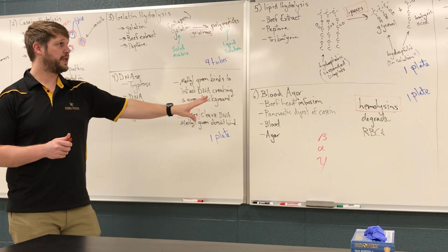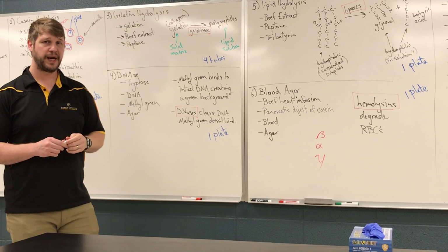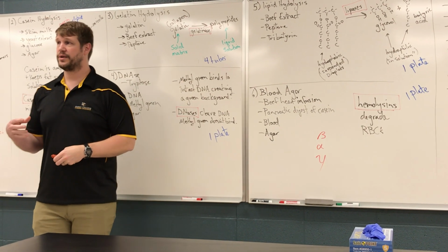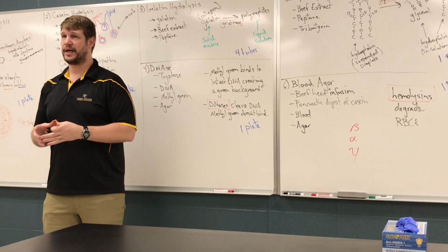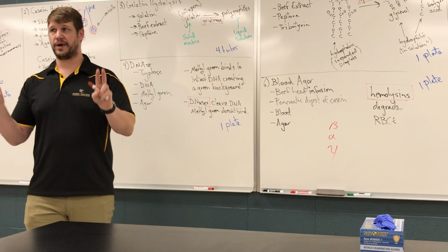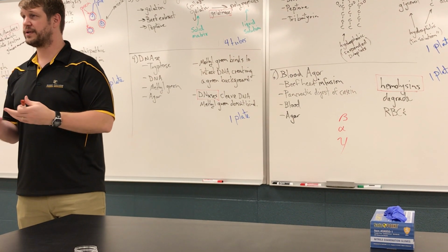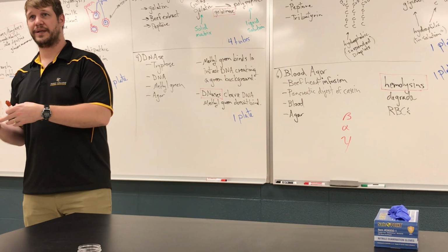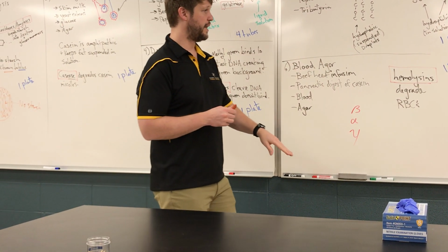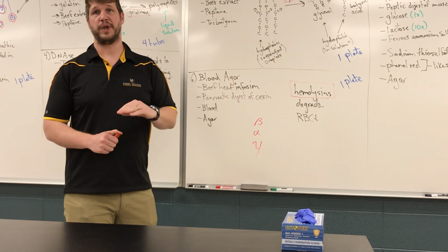The 6th media today is blood agar. Blood agar, in addition to being a differential media, is also used as a substrate for growing certain organisms that we call fastidious, that have very unique requirements, that are hard to culture in general. So there are some organisms, particularly a number of human pathogens, that only grow well on blood agar.